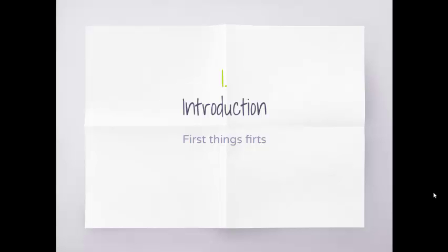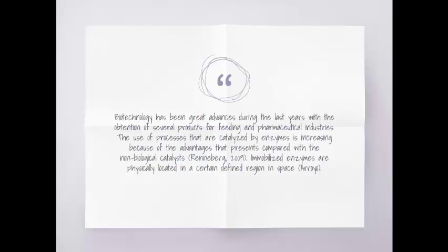Introduction. First things first. Biotechnology has made great advances during the last years with the obtention of several products for the feeding and pharmaceutical industries. The use of processes that are catalyzed by enzymes is increasing because of their advantages compared with non-biological catalysts.